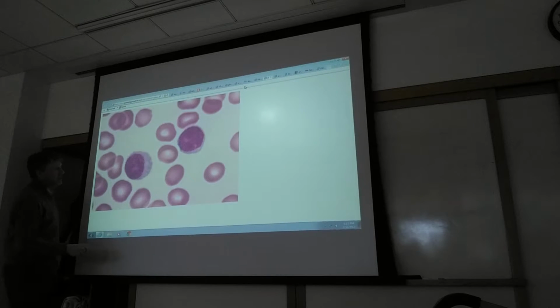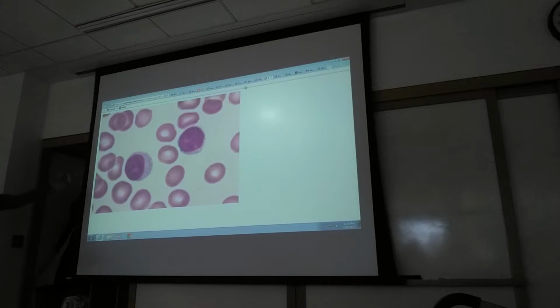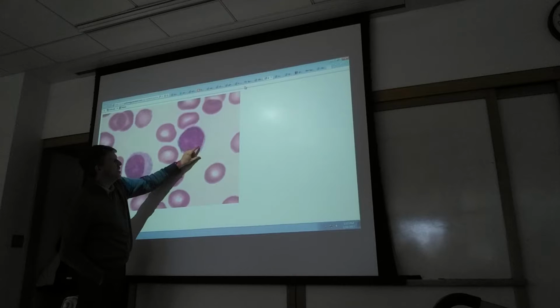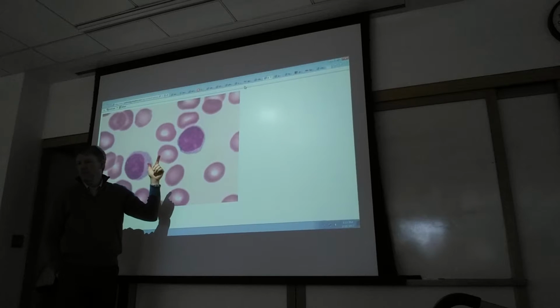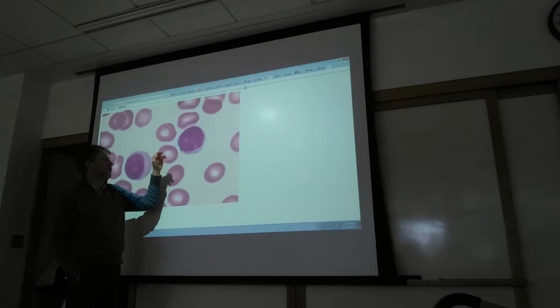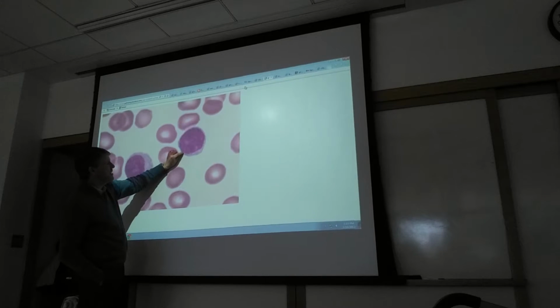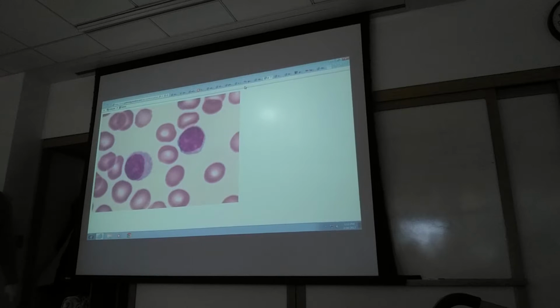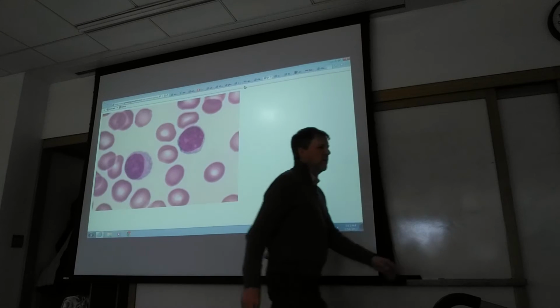Sometimes it looks like it's all nucleus. So sometimes you may see something like this, and you've got just a very thin rim of cytoplasm. And I think that's why sometimes students confuse these with basophils. If you can't see that thin rim of cytoplasm, and you just see a big purple dot, sometimes students are like, well, wait, that's got to be a basophil. Look for chunky purple dots, though, and that's going to lead you down the path of basophil. Here you don't really see big, chunky purple dots. Let me show you another picture of lymphocytes.